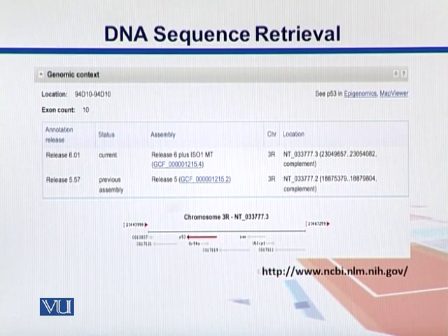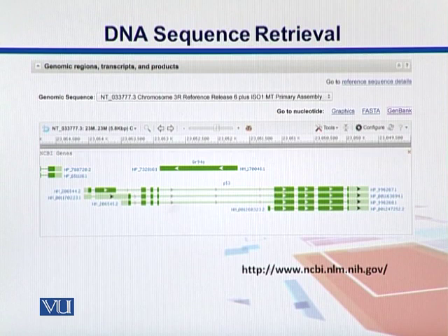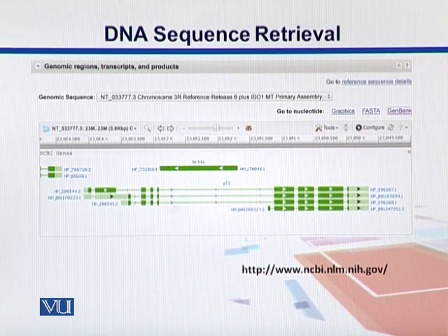We can also see the orientations and the directions in which it is going. In the genomic regions, transcripts and products tab, we can look into its products. When genes are expressed, the DNA is converted into RNA. Since it's a eukaryotic genome, there is alternative splicing, so we can find different alternative splice variants of this gene. Towards the upper right side there is written: go to nucleotides, graphics, FASTA and GenBank — these are the different views with which I can access the data files associated with this gene.